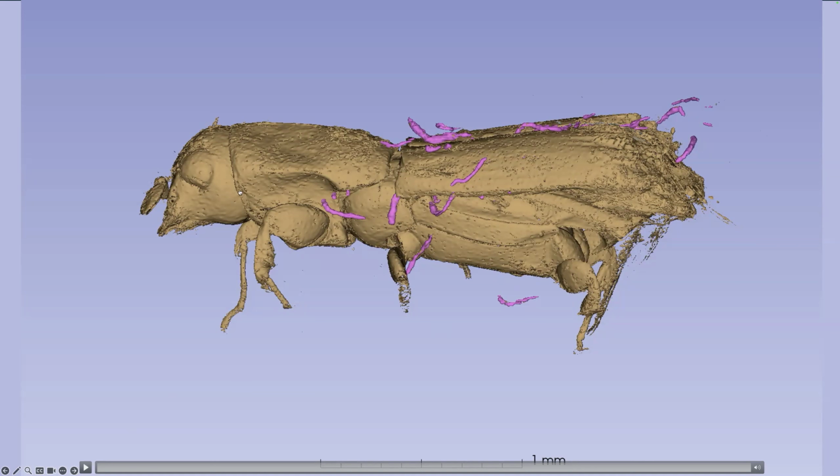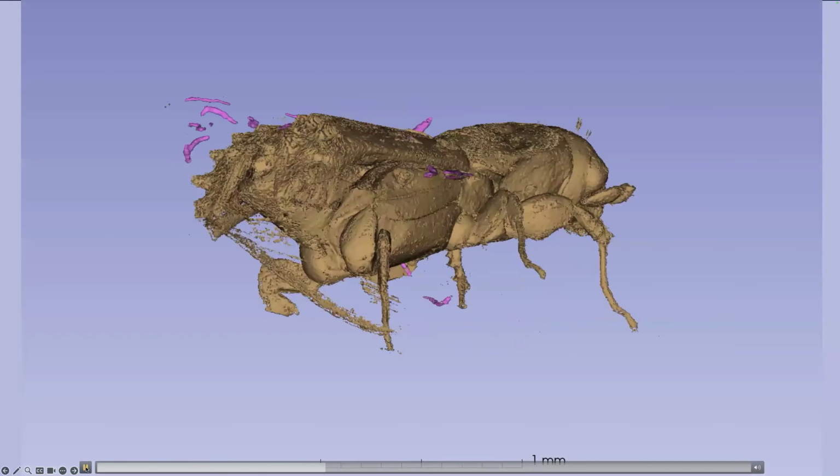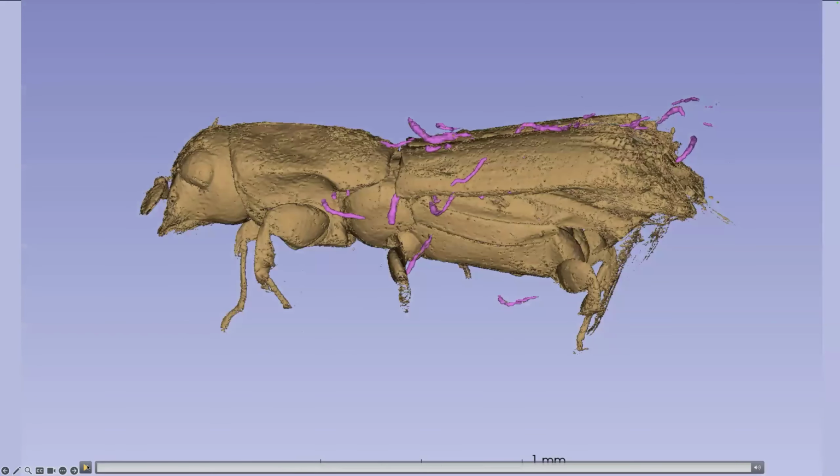X-ray microtomography data set, I've gone in and interpreted the thing. So the platypodid I've used thresholding for. But again, the density contrasts are very small. So each of these purple things is a nematode that we've seen in the photograph. But I've had to do those by hand, often in a tea room in Kuala Lumpur, with people walking past and looking over my shoulder and saying, what are you doing?